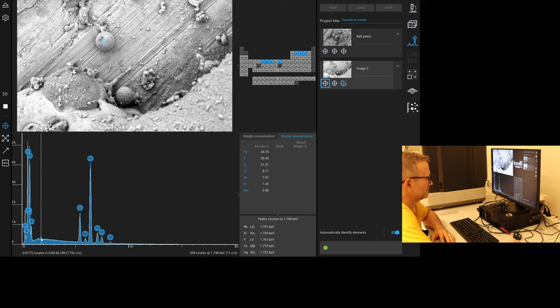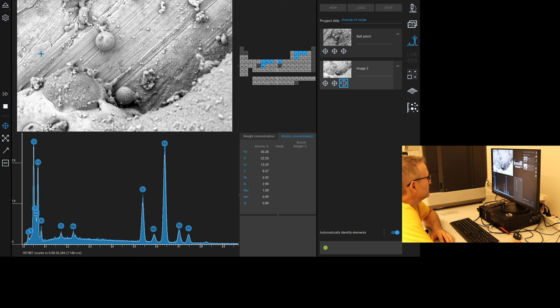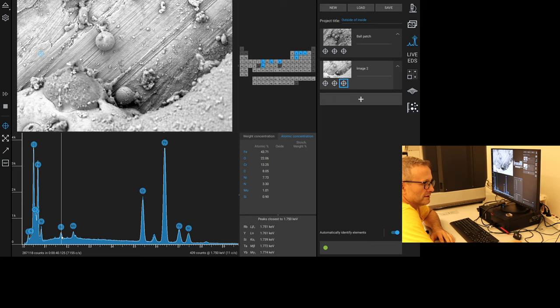There's the silicon bit. And the last sample is this area, which should be easier to see. And actually, there we go. So we actually have silicon, it would seem, in the substrate. There we go. Is that really molybdenum? Maybe. Kind of gives the impression that this is a different type of steel than the outer one. Interesting.